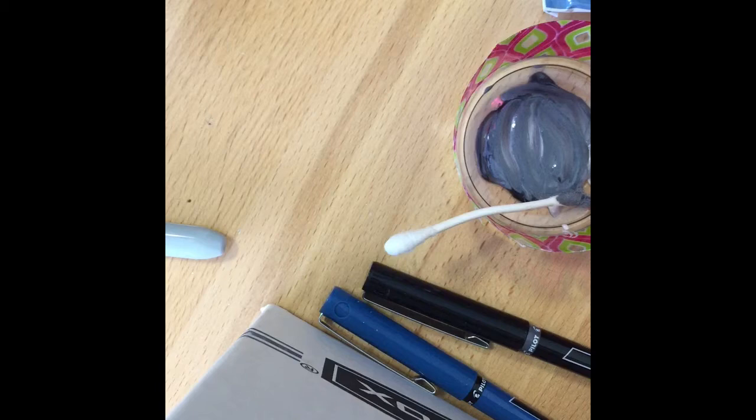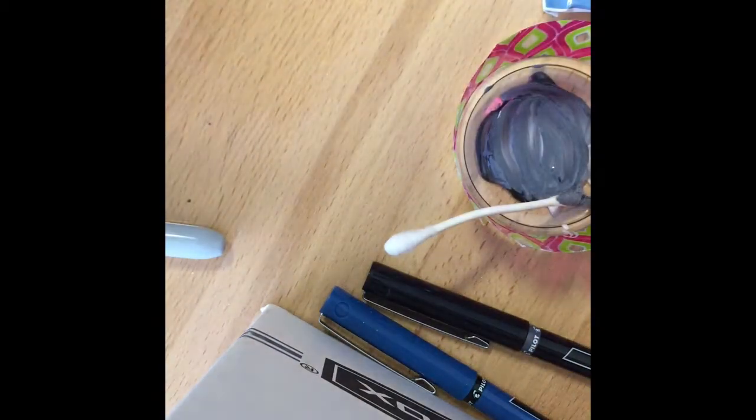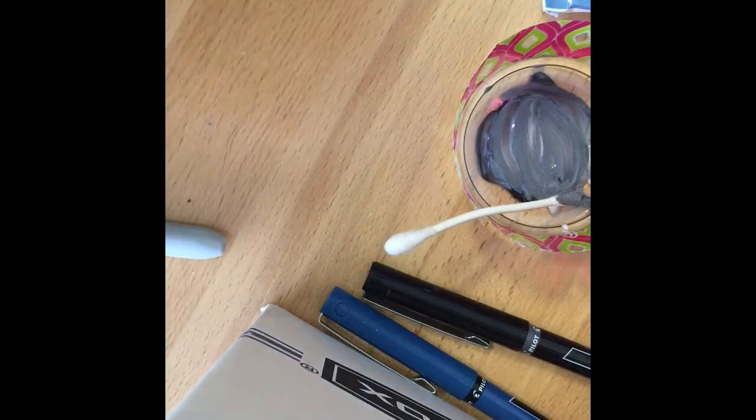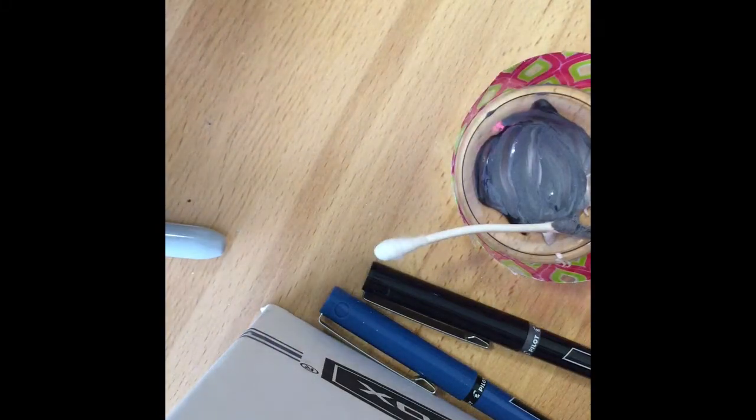Now, for full strength, it recommends waiting for 24 hours. We're not going to do that because I want to see if I can break them apart. I have no use for this. I'm probably going to throw these parts away afterwards. But for simplicity's sake, we'll see if we can break them apart in about 4 or 5 hours.